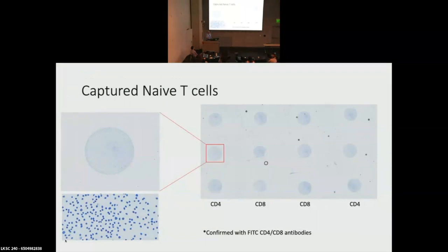Here's the spatial part. Well, it's also special, of course. First one to do that, right? Spatial special. We can see the naive T cells, right? We can see the cells. They're captured on the spot. This is an antibody capturing CD4s or CD8s. And so there they are. Now we can generate beautiful signal, and now it's just a matter of resolution, instrumentation, optimization. We're going to get there to be able to see, is this glycome different than this one? Probably not, but let's see.